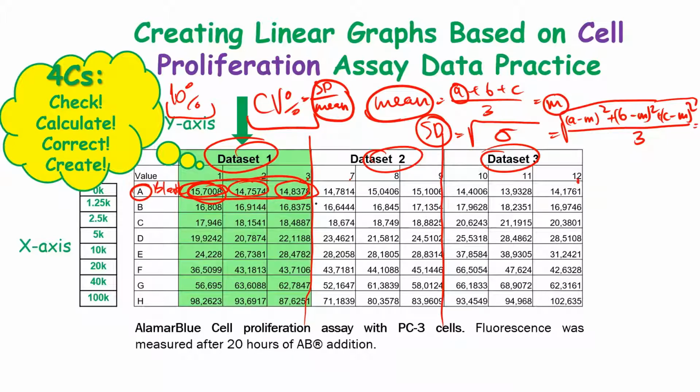Okay, so why would you want to have 3 replicates of 3 replicates? So in total, 9 wells for the same condition. It is because when you have 3 replicates, so let's say you have 0.5, 0.6, and 0.8. Okay, so it does not look suspicious now. But if we have 2 sets of replicates more, you might actually see the difference.